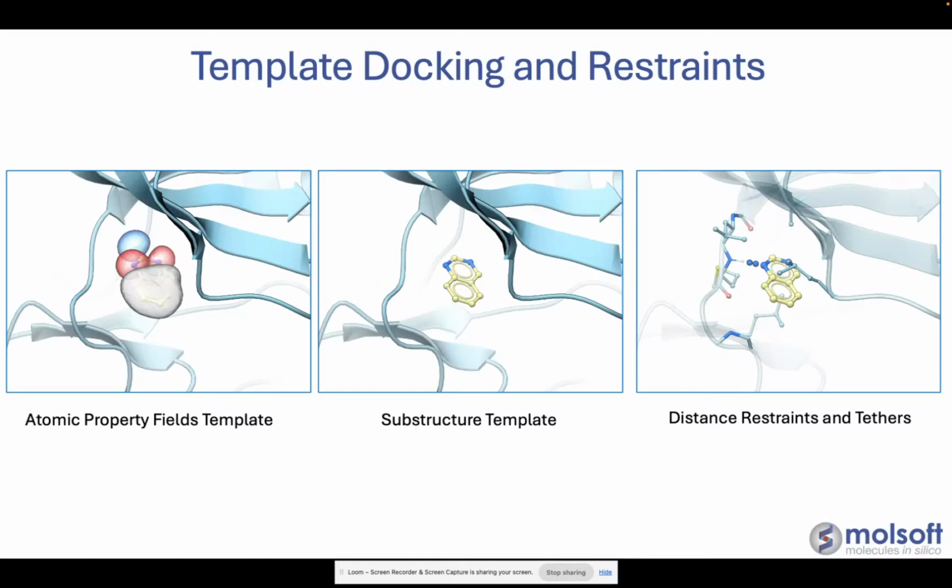This video shows you how to use templates and distance restraints and tethers when docking. For templates, you can either use atomic property fields or substructure. This is while docking in the 3D Ligand Editor.